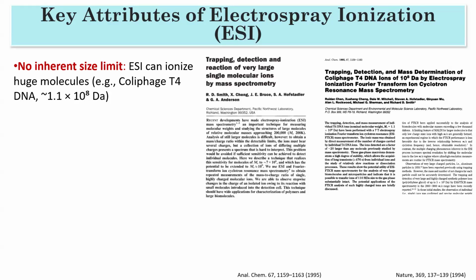Of course, if in your lab you have many mass spectrometers, then you need to think about that. But most of the time, we don't have so many mass spectrometers in the same lab. So whatever you have, you can just go for that and see whether you are getting the molecular ion peak or not.